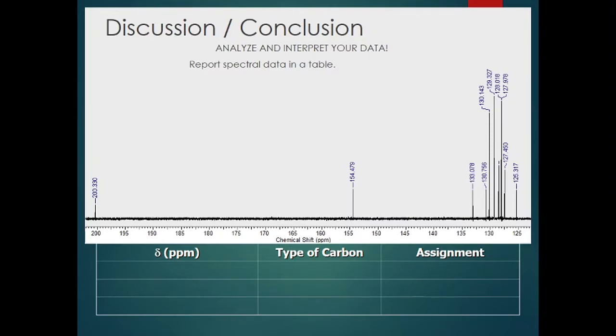Now let's talk a bit about the NMR, the interpretation. The spectrum we see here, the way we approach this, start with the chemical shifts.